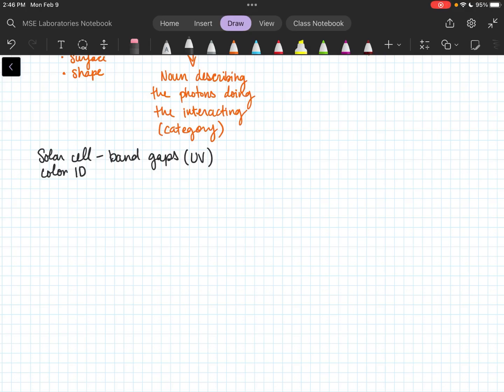And then, really simply, we can just have photons get absorbed because they're lost in the material. Like, glass is so thick that it scatters the light up and down and left and right and side to side until the light just has no more energy to push all the way through the material. So there are some reasons why things get absorbed or why we maybe would want to measure.